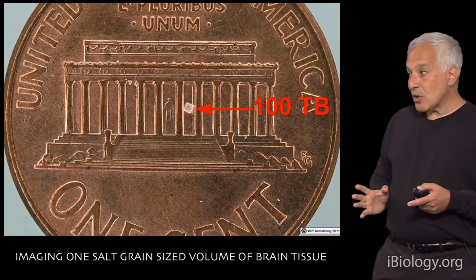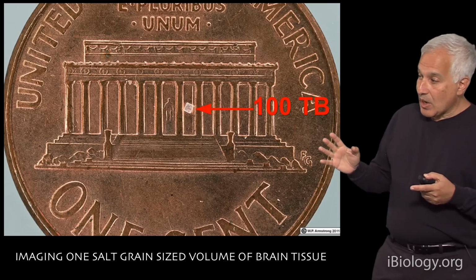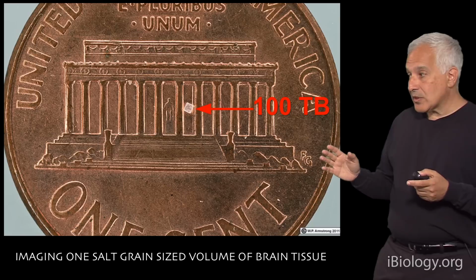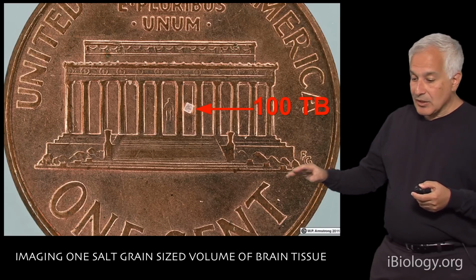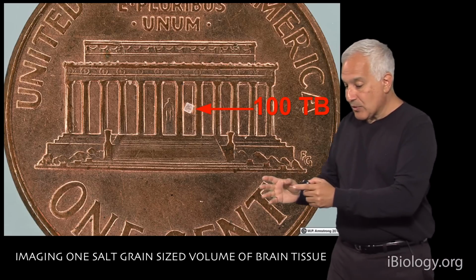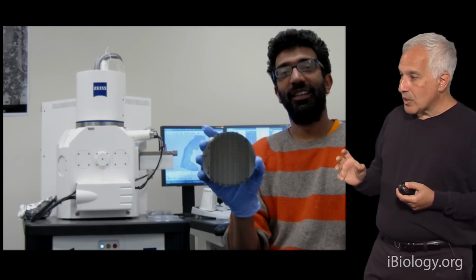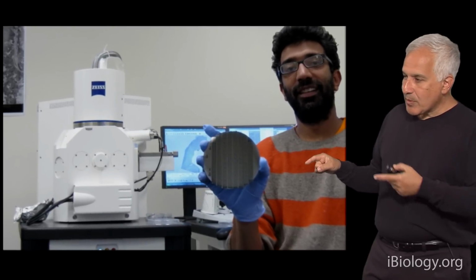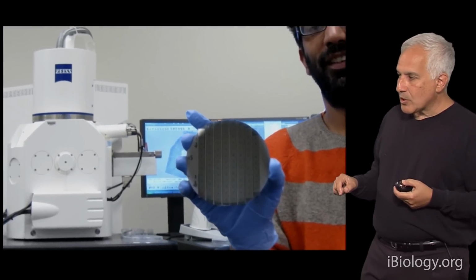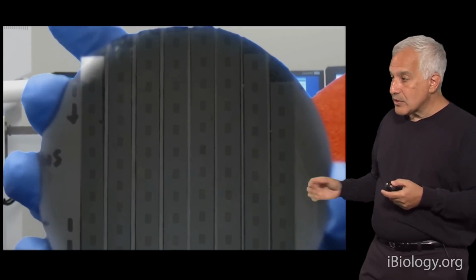The next thing I'd like to show you is what does the data actually look like? I'm going to show you not a piece of thalamus, but a piece of cortex. By zooming in the way you might in Google Maps, start from a long distance and zoom in to finally see the structural details. And this is Bobby Kasturi, who is the person who optimized our use of scanning electron microscopes for this. I asked him to hold his hand really still as we zoomed in on one of these 30 nanometer sections of cerebral cortex.